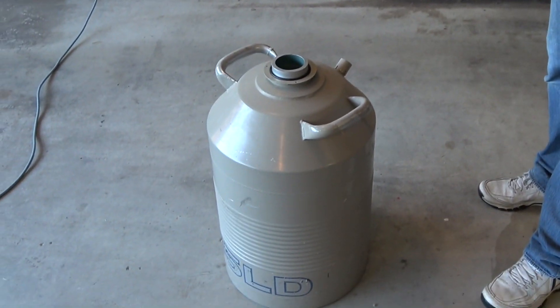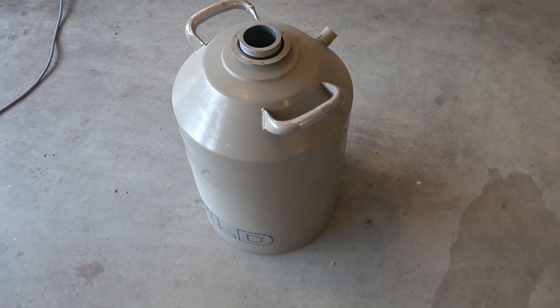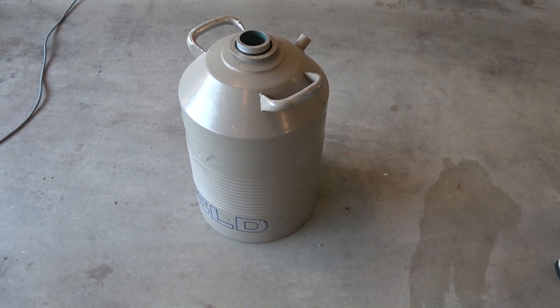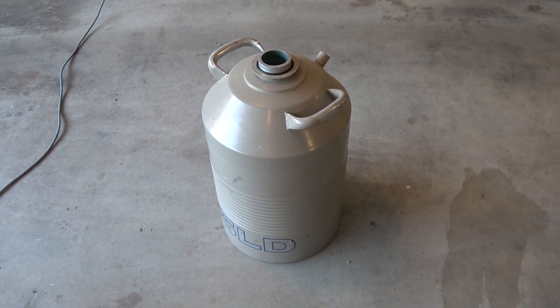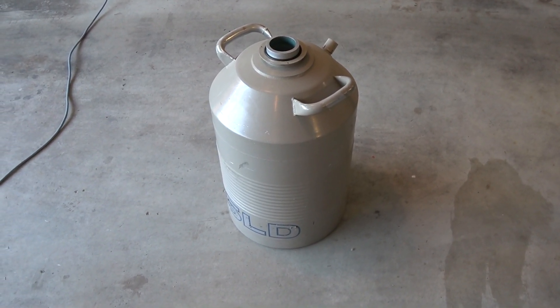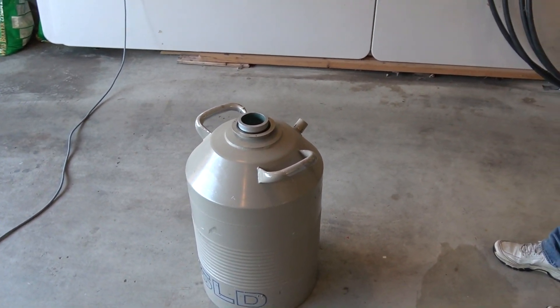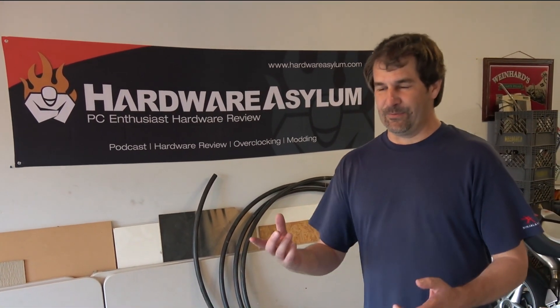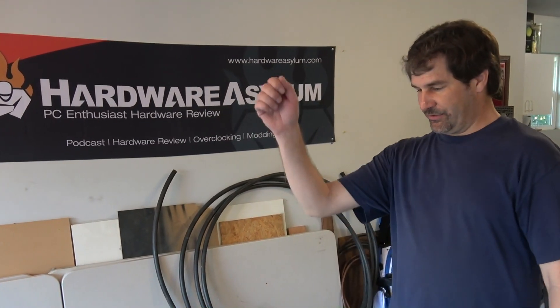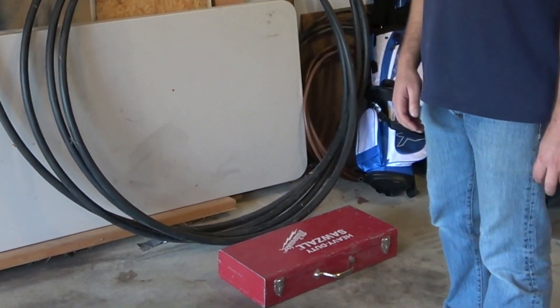So we're going to cut this thing open. It's looking pretty hefty. What are we going to cut that with? A Sawzall. That doesn't seem very smart. Haven't you used the Sawzall before? Yeah, to cut wood — but it says it in the name, Sawzall. What we're going to do is use a metal cutting bit, and five minutes later I think we'll be done. I'm not so sure this is going to go well, but alright, let's find out.